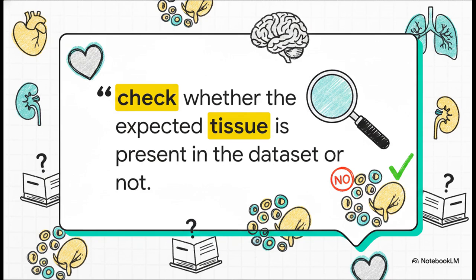And here is a crucial best practice straight from the tool's documentation. Always check if the tissue you care about is actually in the dataset you selected. For example, imagine you are studying a list of trophectoderm-specific genes from a single-cell RNA-Seq analysis. Because the placenta is derived from the trophectoderm, you would strongly expect to see placenta tissue enrichment. But if you chose the GTEx dataset for your analysis, you would find absolutely nothing. Why? Because the placenta simply does not exist in the GTEx dataset. It is entirely absent. However, it is present in the Human Protein Atlas dataset. Your choice of dataset entirely dictates your discoveries, so always know what's in the library before you start searching for books.